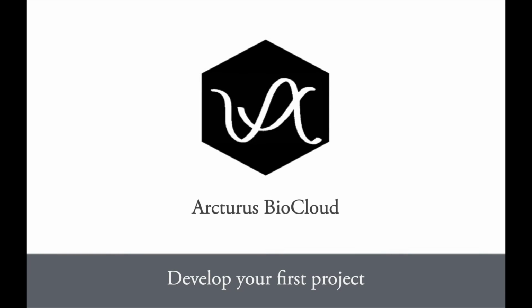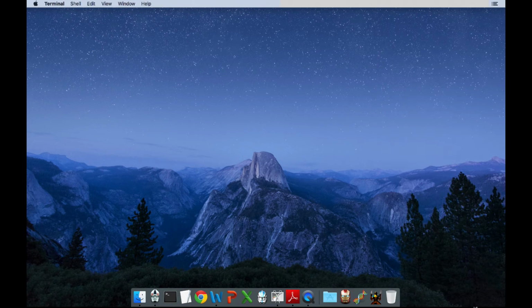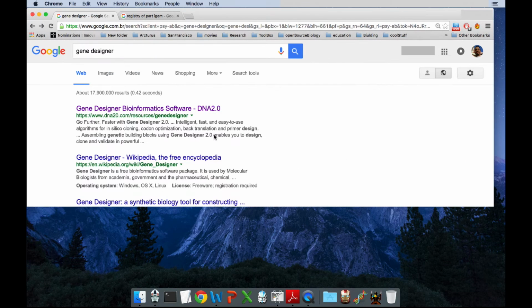If you don't know how to build a genetic construction, continue watching this video so I can show you. First, you need to go to a browser. Then you need to find a software for designing DNA. You can just type down Gene Designer. There are several free softwares. One of those is Gene Designer from DNA 2.0.